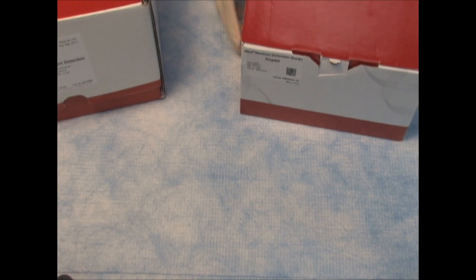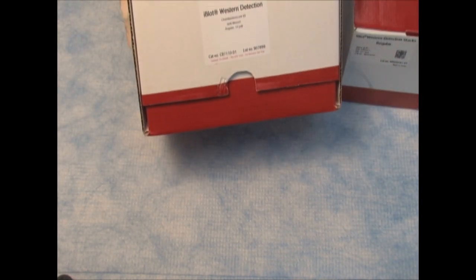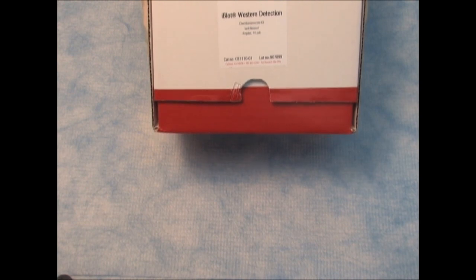So let's begin by unboxing the iBlot Western detection kit. The kit comes with two boxes. Here I have the stacks for performing the Western, and then I have a box containing the reagents. So let's see what we get in the reagent box.